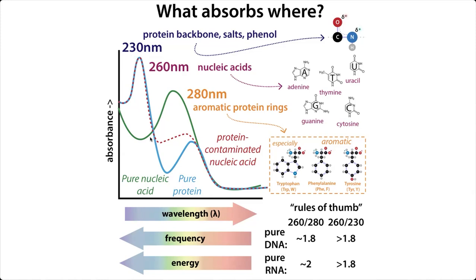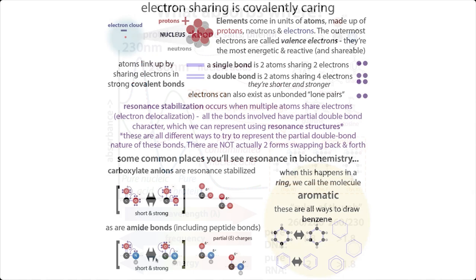It's a technical note. If we were to think about a colored dye, it would have to absorb an even longer wavelength of light, which would mean you would need even more resonance. And so dyes are typically going to have extended conjugation. Conjugation and resonance are similar terms that we use. They'll have these ring structures with lots of resonance. You can kind of tell if something has resonance if you see alternating single and double bonds. Sometimes you might see things represented with a dotted line.